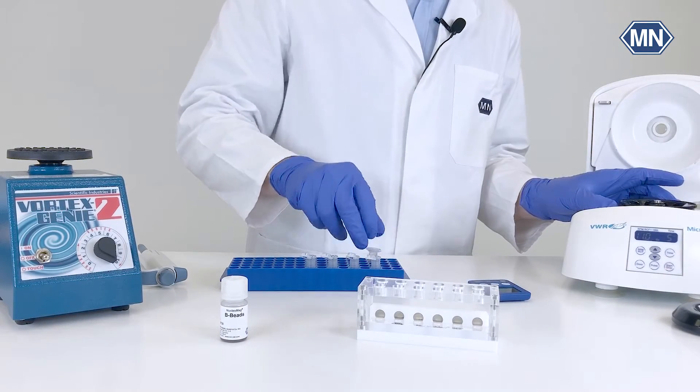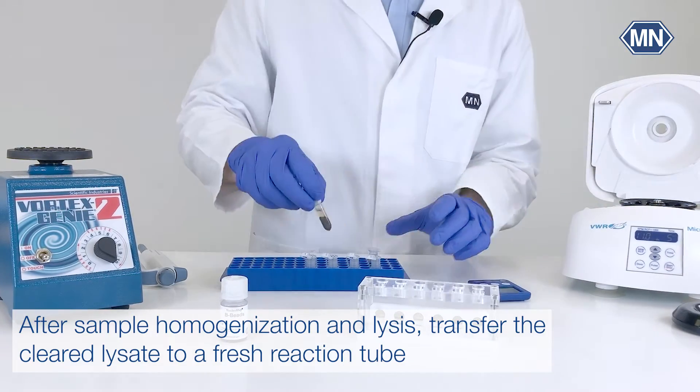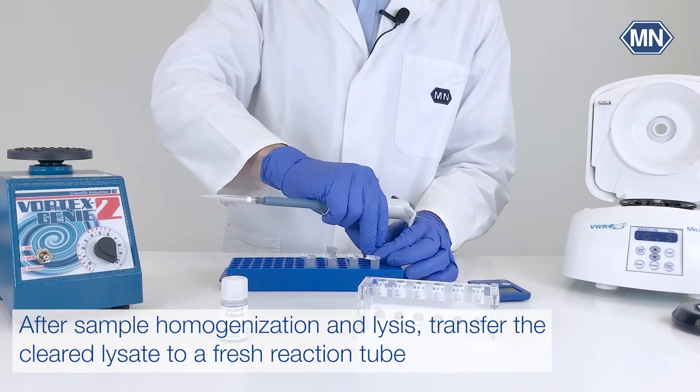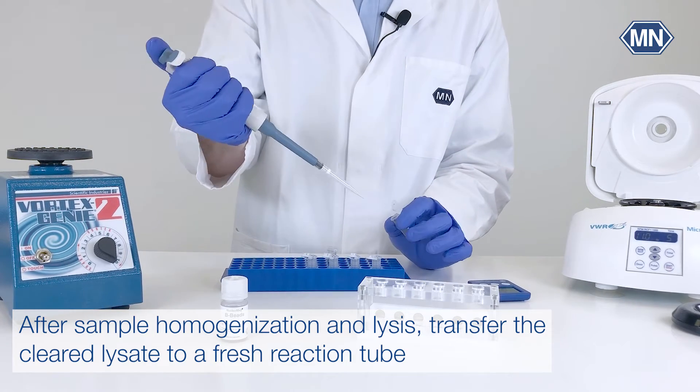In the first step, your sample of interest will be homogenized and lysed. Afterwards, the properly cleared lysate will be transferred into a fresh reaction tube.